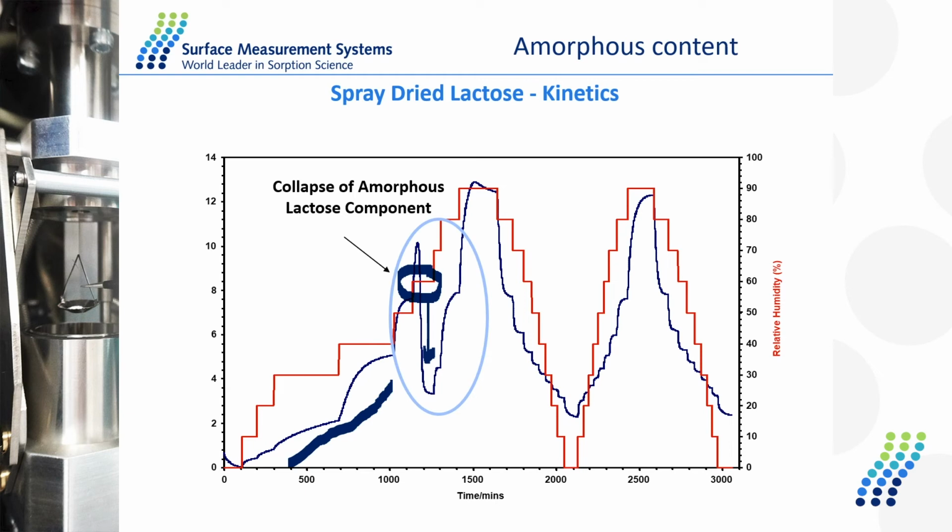However, an amorphous material, due to this irregularity in the structure, has a lot of space that can be occupied with water. So whenever a material moves from an amorphous form to a crystalline form, the surface area available for solvent reduces. Consequently, when it reorders, it releases molecules of water or organic solvent that have been absorbed, losing mass. And here it is very evident that there is a significant mass loss caused by the crystallization stage.